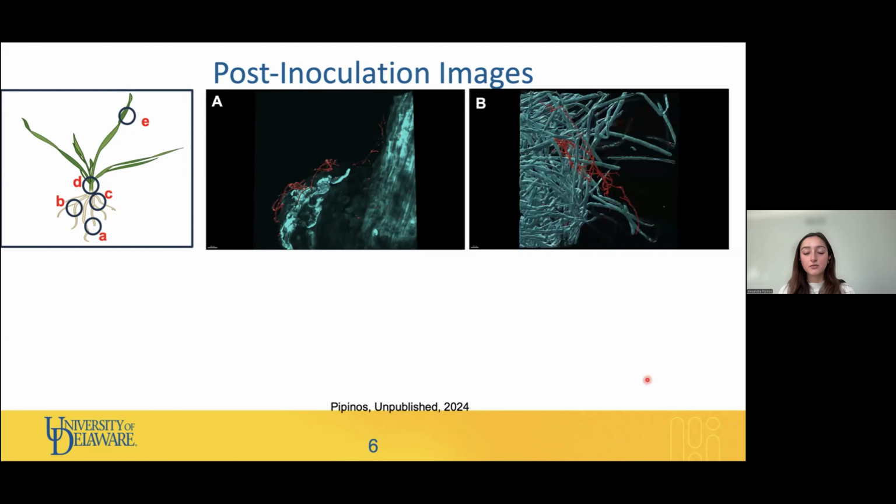A surface analysis was conducted for the WGA channel, so that was the Streptomyces channel in Imaris. That allows us to examine more the positioning of the Streptomyces coelicolor around the root hairs. And you can see more hyphae tightly wrapping around the root hairs. And it's even evident that the Streptomyces are extending beyond that initial colony in the upper left section.